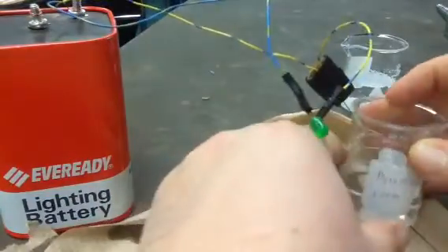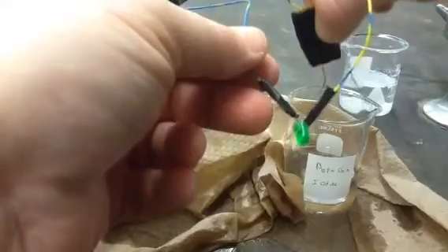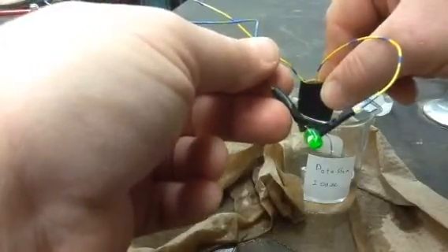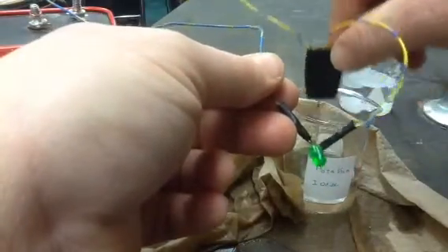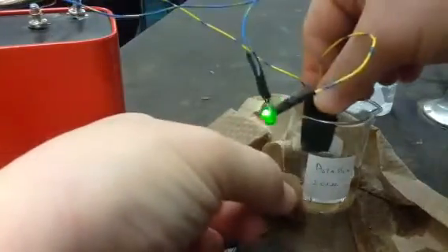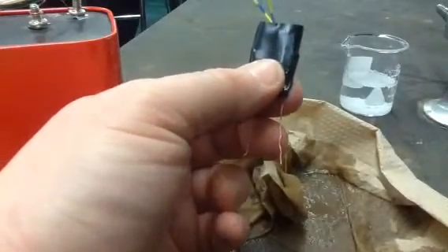Then here's our potassium iodide. So we have potassium iodide solution, we have our probes, and we get a clear light up with potassium iodide, as long as I get both probes into the solution. Very, very clear conduction there. That's one heck of a conductor. Wow. Like we're electroplating our probes. It's that good a conductor. Not electroplating, but we're reacting off the copper. Okay, so potassium iodide conductive.